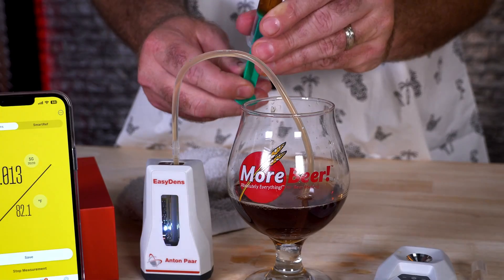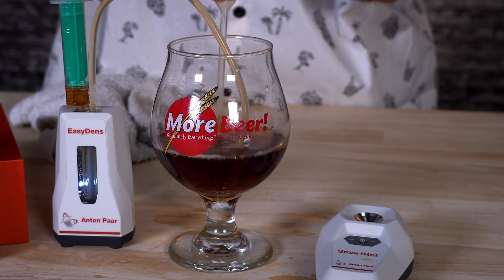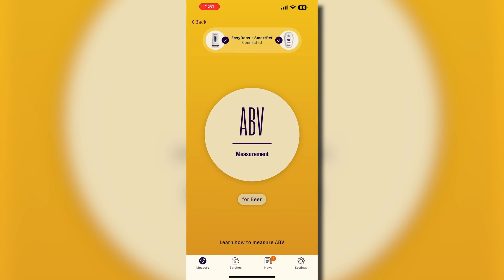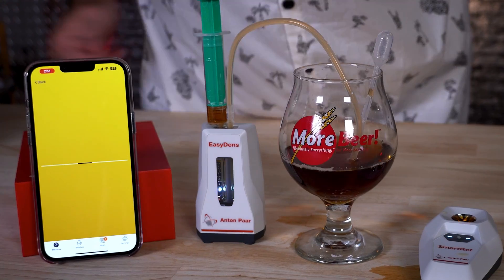To do this, go ahead and turn on both devices and set them up like you normally would if you were taking a measurement with the EasyDens and the SmartRef. But you're going to notice, if you have both devices on your app, a little button that says 'Measure ABV.' Go ahead and click that. As long as we have them both ready to go — degassed and filled up — you just hit that 'Start Measure ABV' button, and it's going to measure the ABV.